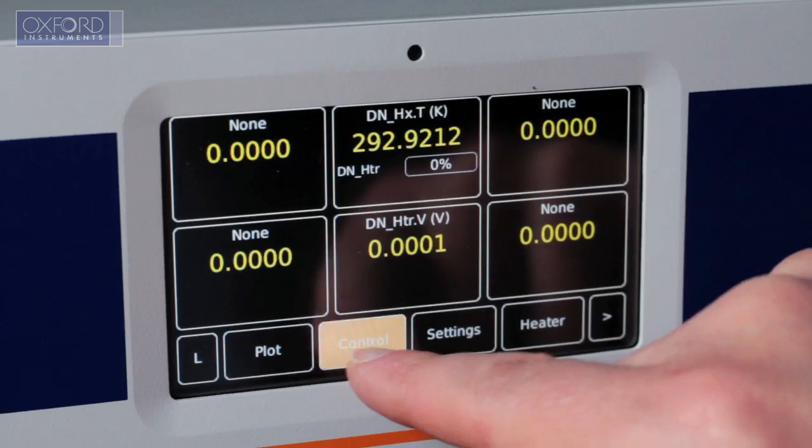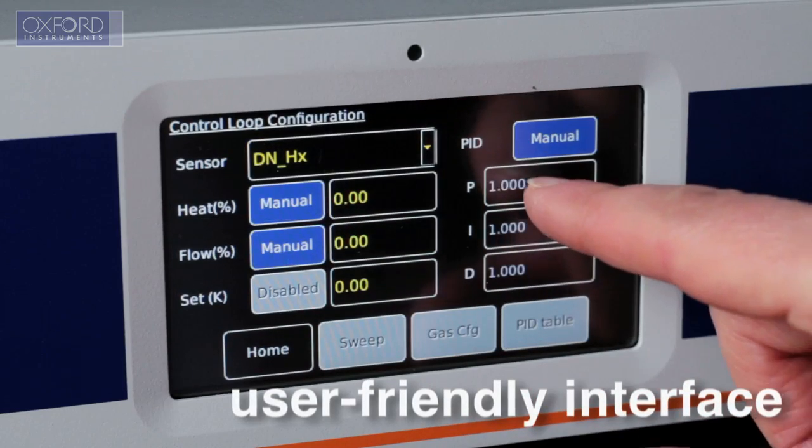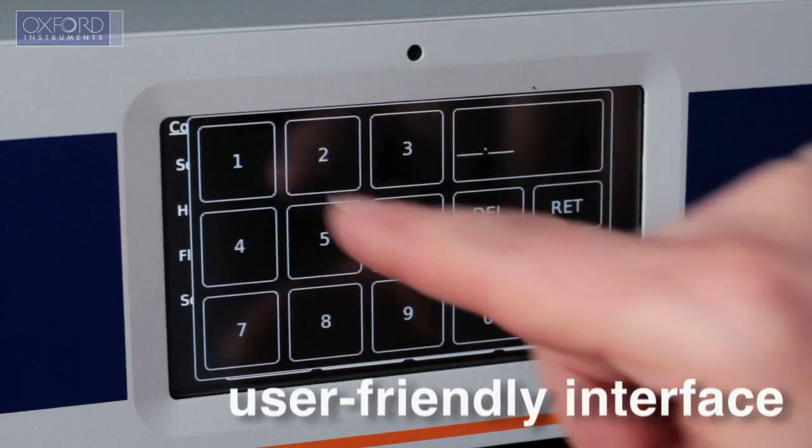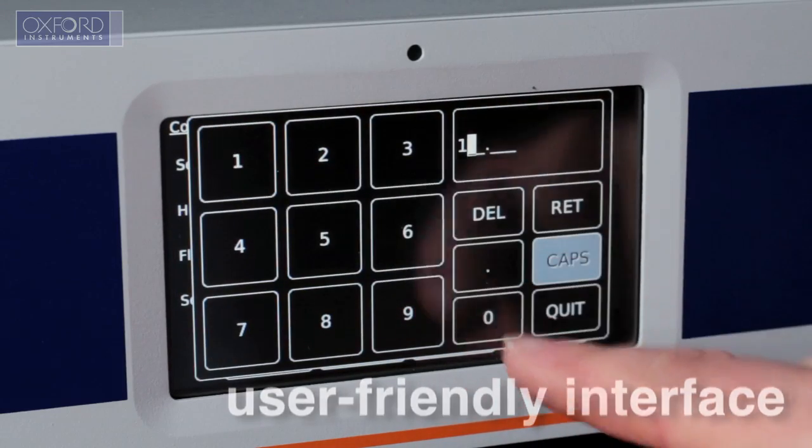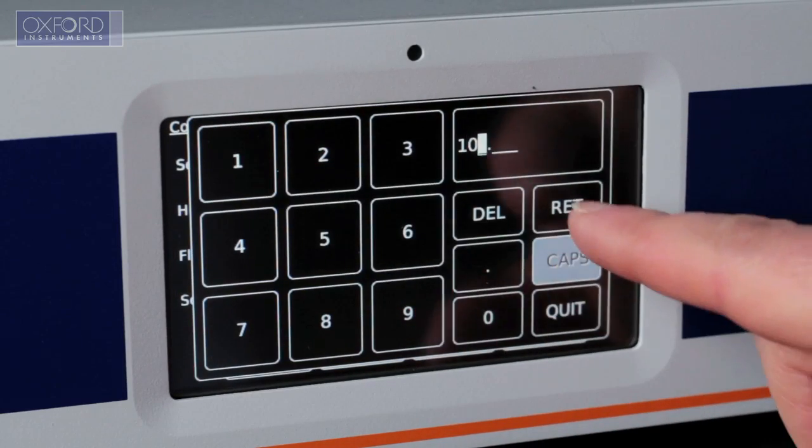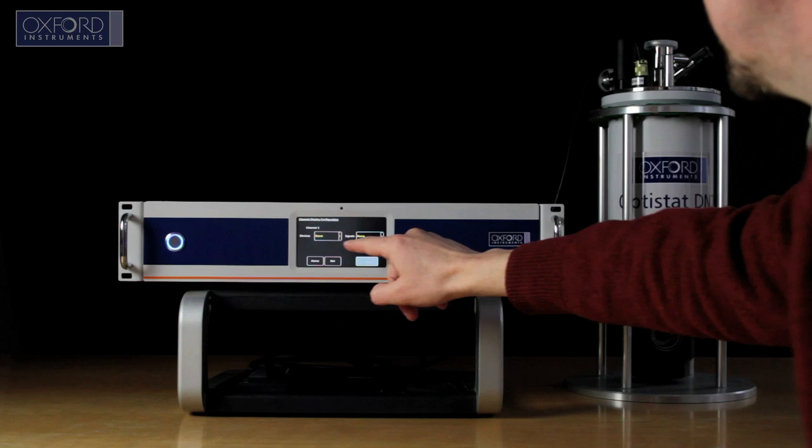The intuitive touchscreen user interface facilitates easy monitoring, control and configuration of your experimental system.